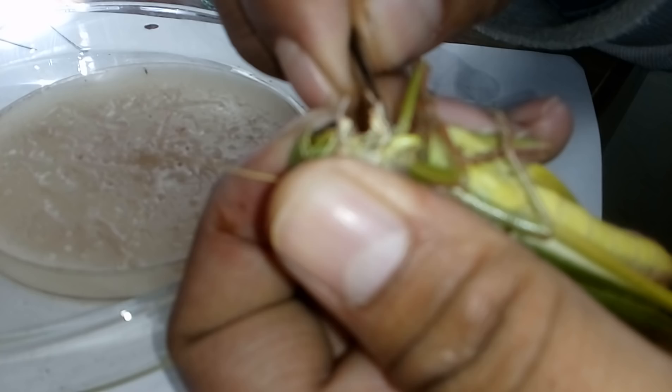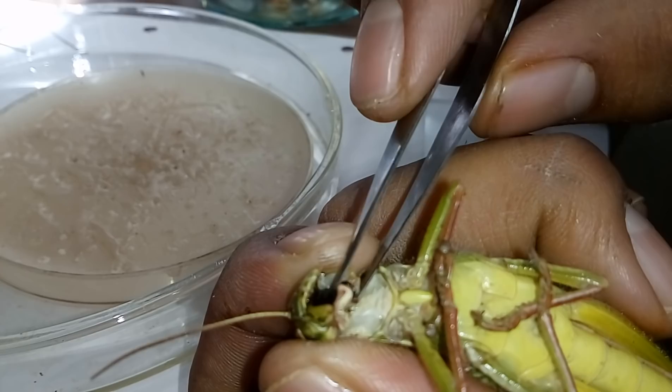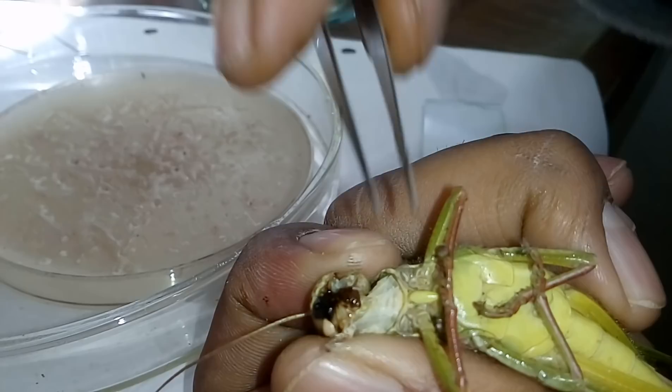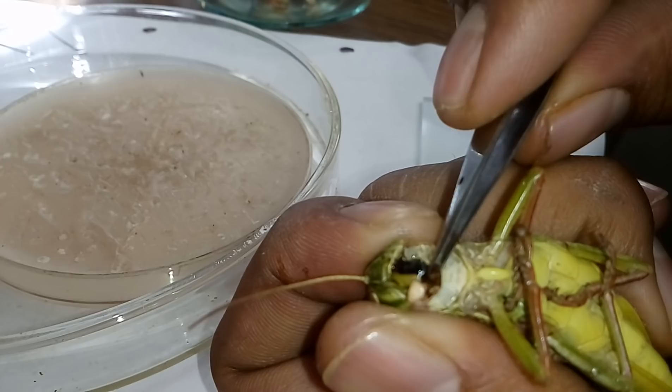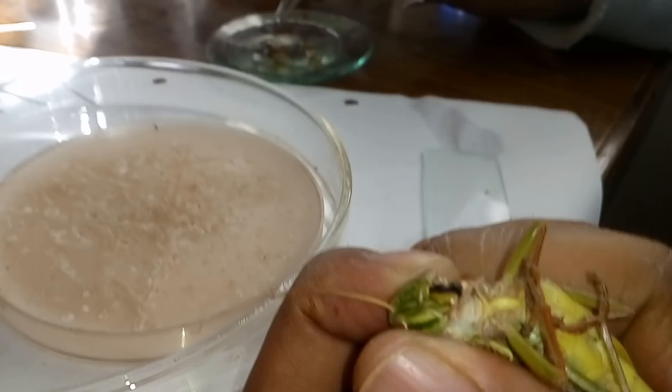This is the labium — again put it into alcohol. Now we have to remove this black structure. After removal of the labium, the black structure is very clear. This is known as the tongue or hypopharynx. We can pull it easily — it is actually attached to the pharynx. This is the hypopharynx. Put it into alcohol.